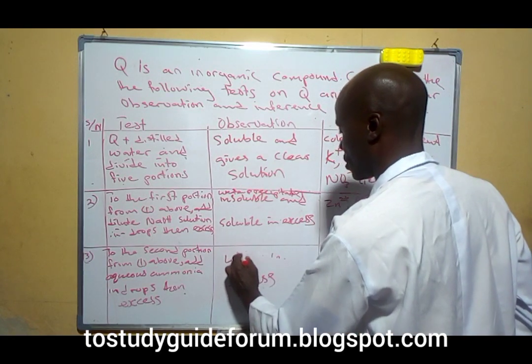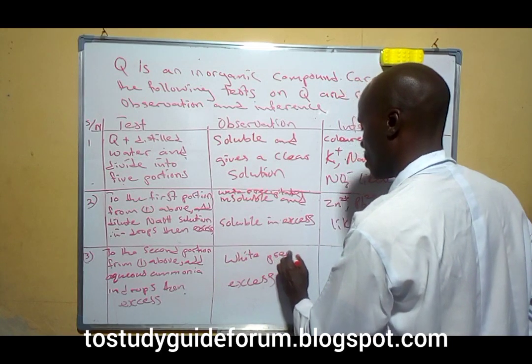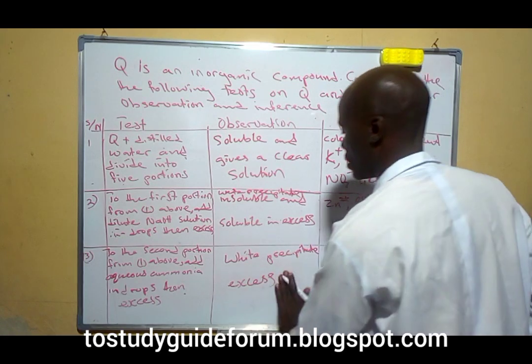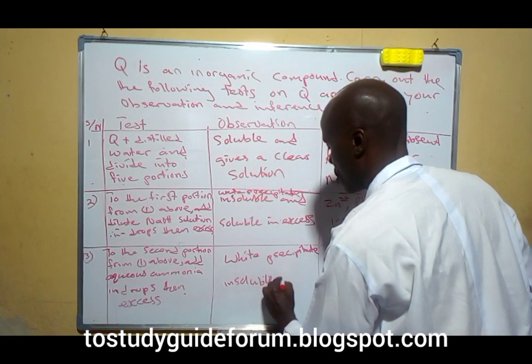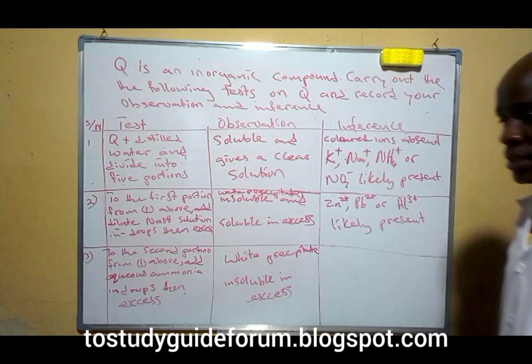We also have a white precipitate here, insoluble in excess.